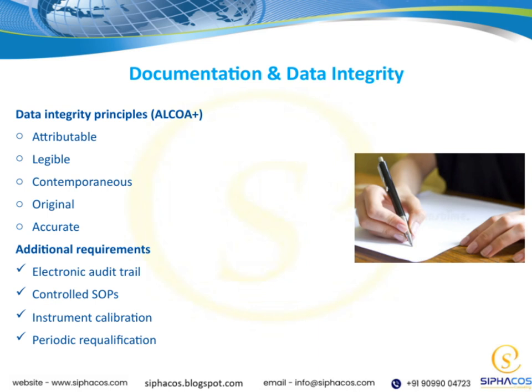All these aspects connect back to our overall goal. Ensuring data integrity isn't just about compliance, but about maintaining the quality and reliability of our data, which ultimately impacts the safety and efficacy of our products.